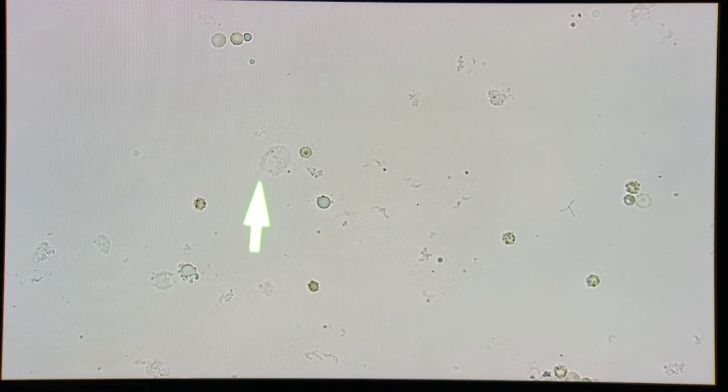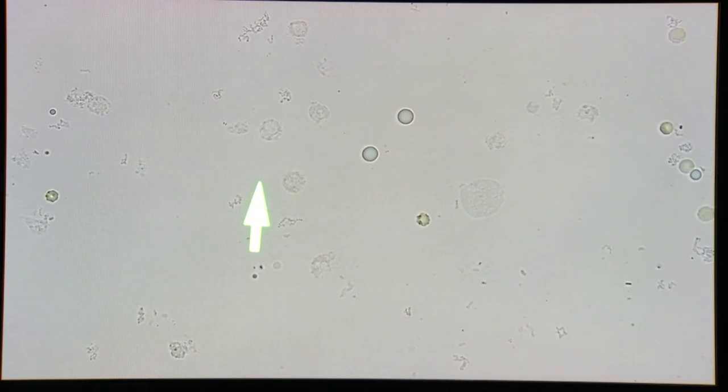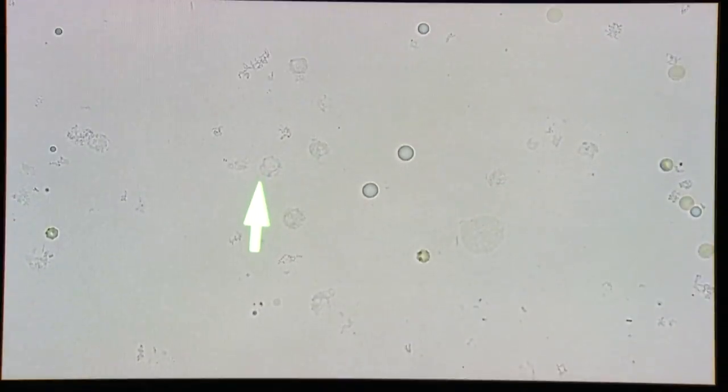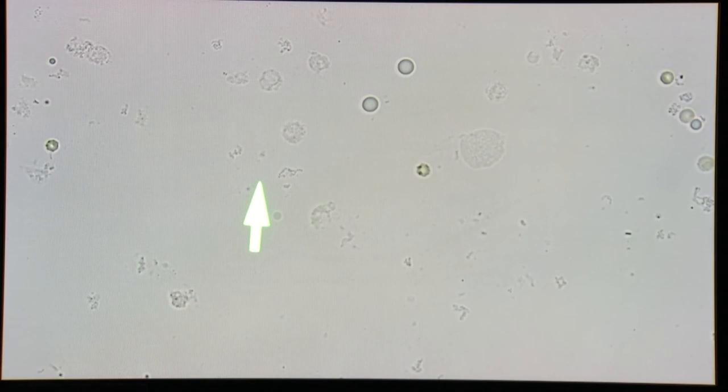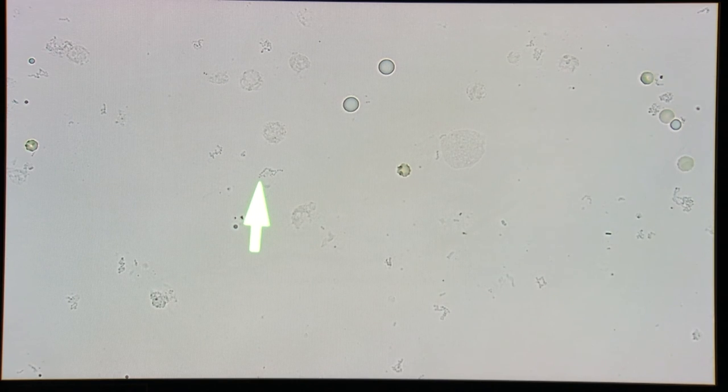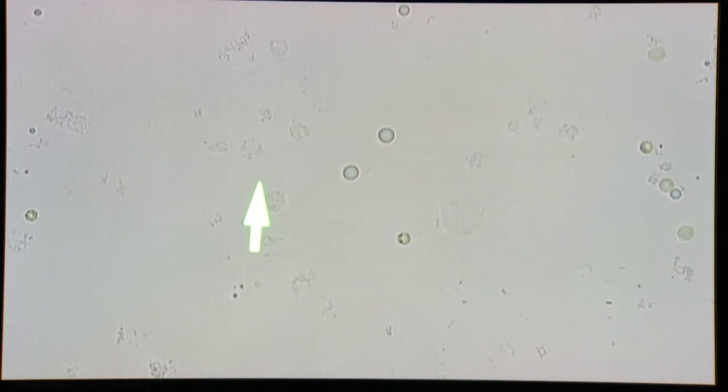We do have some white blood cells in here as well. Some of this other little stuff would probably be bacteria. Bacteria is very hard to see on urine sediments, so sometimes there are additional stains you can do or you can go up to 100 oil to help identify bacteria. That's basically how you would look at your urine sediment.